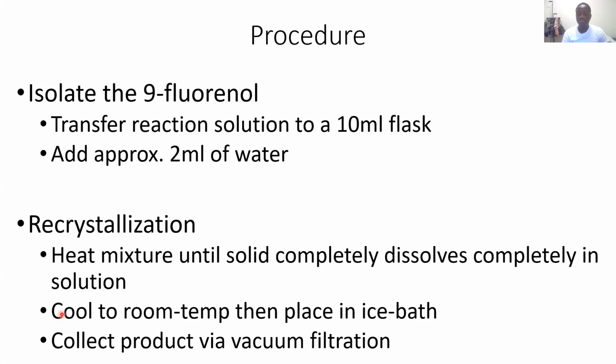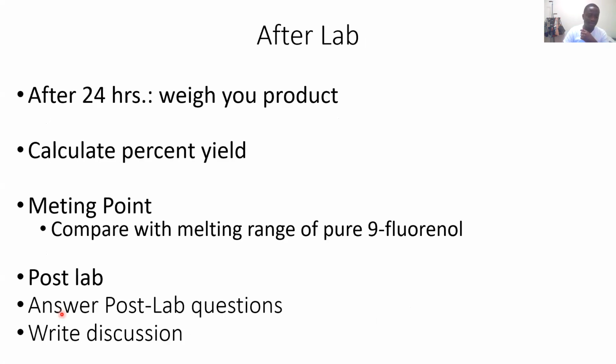That's your recrystallization process. It's very important to know that for recrystallization to work, the product you're expecting, your pure compound, should be soluble when hot and insoluble when cold. Your impurities should be soluble when hot and when cold. That's the only way your recrystallization process can work.